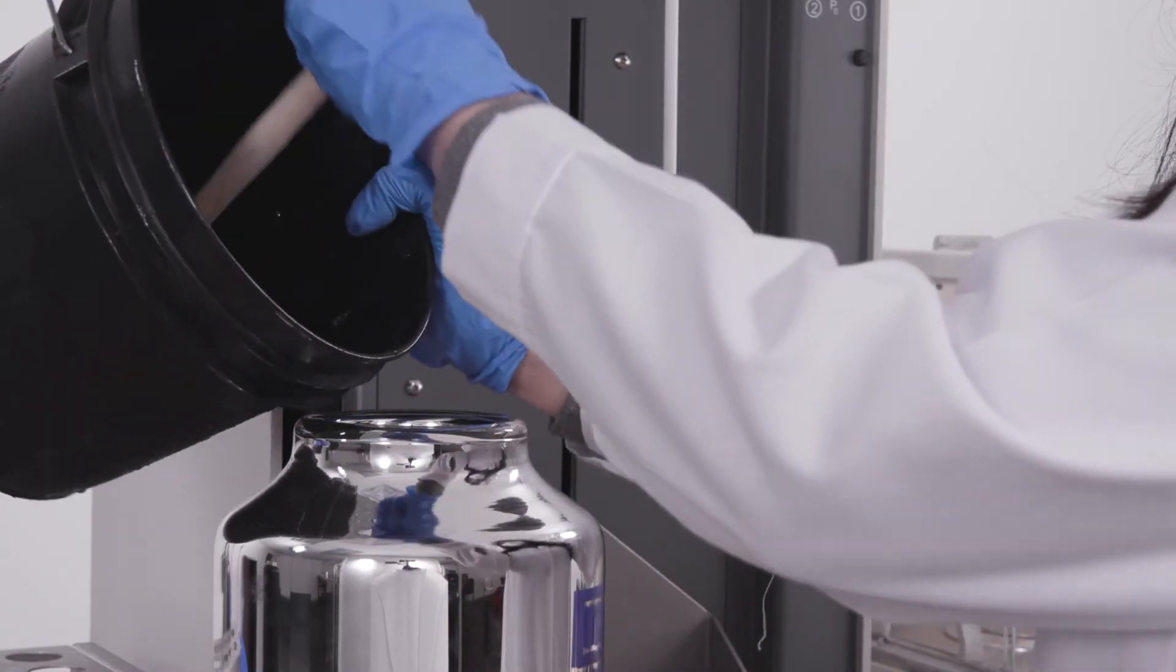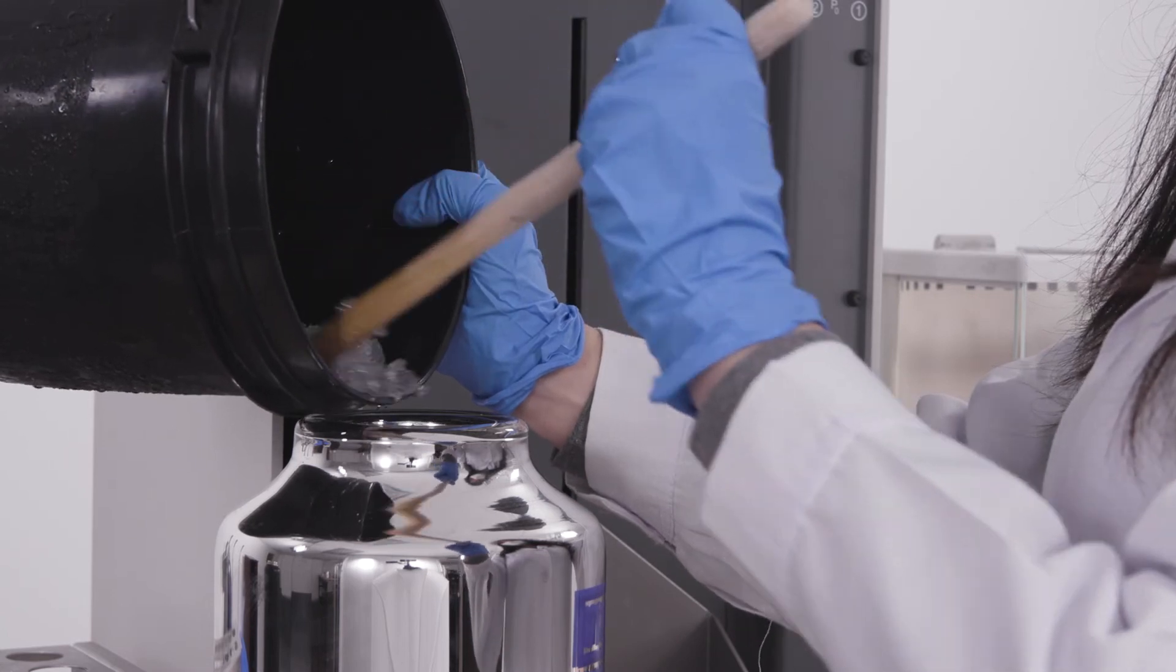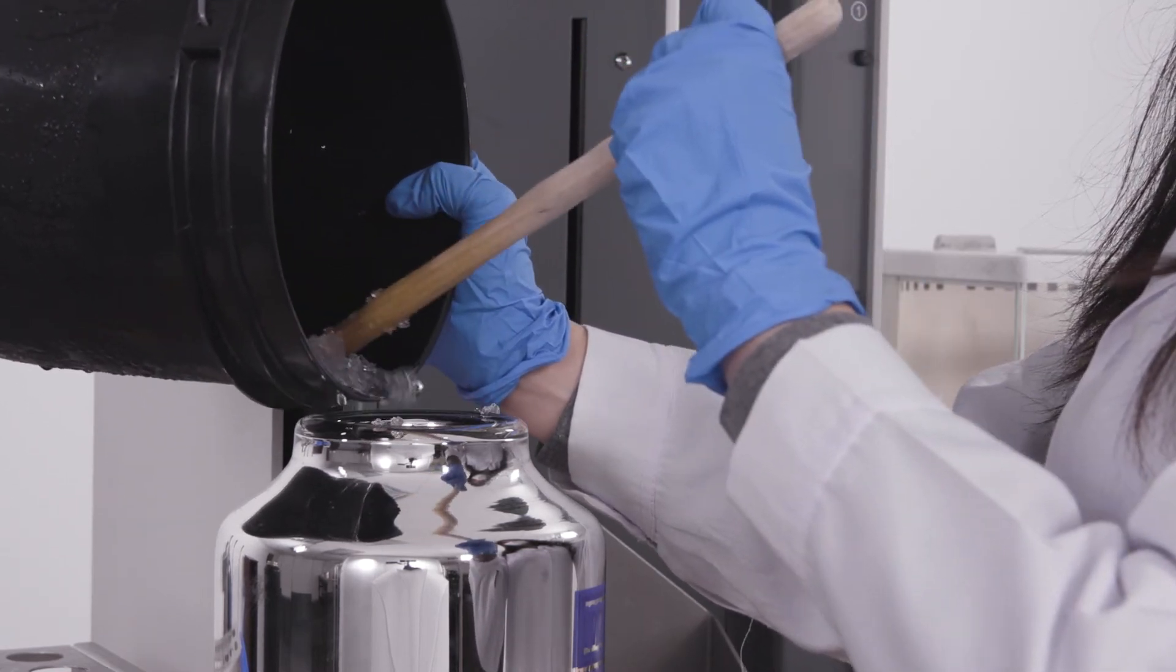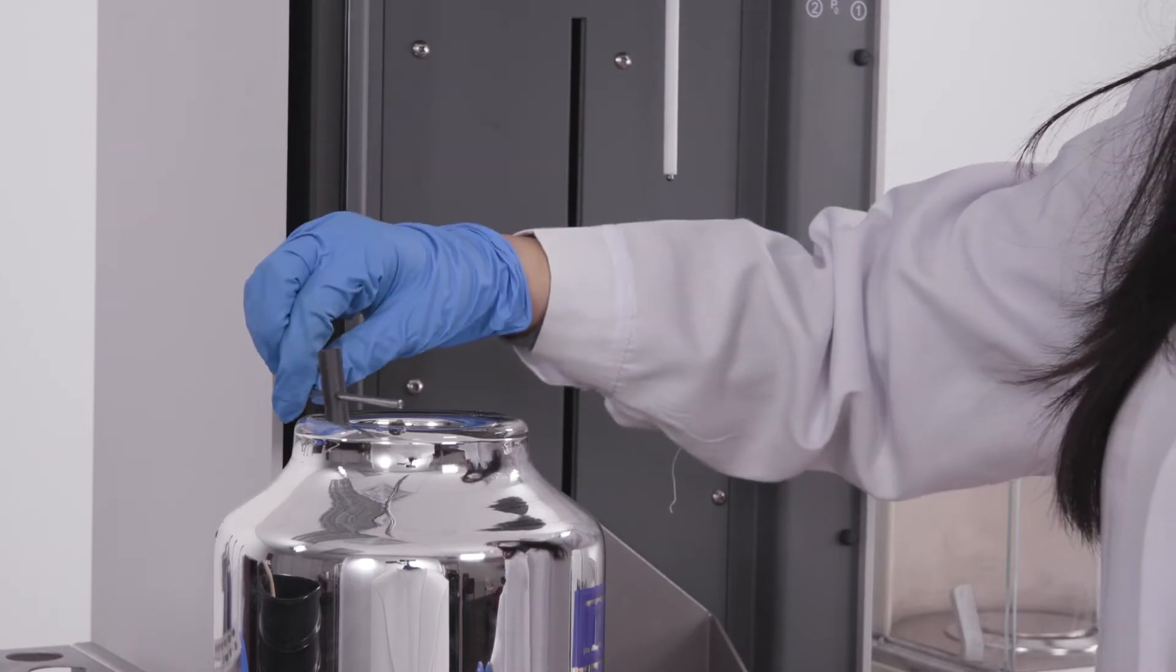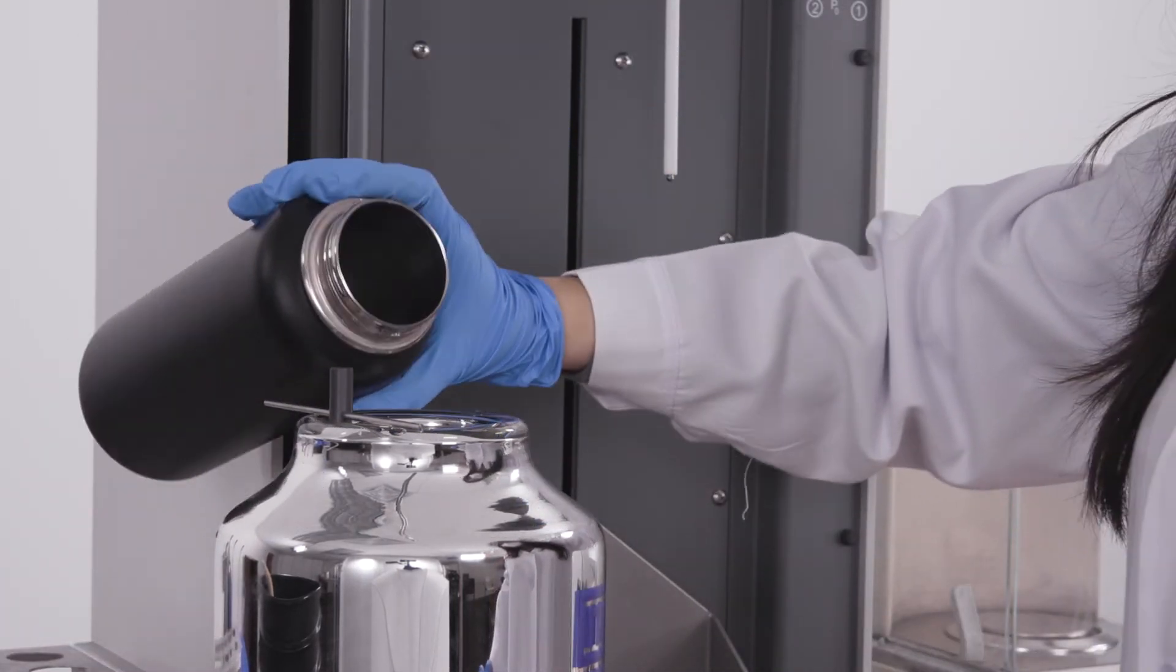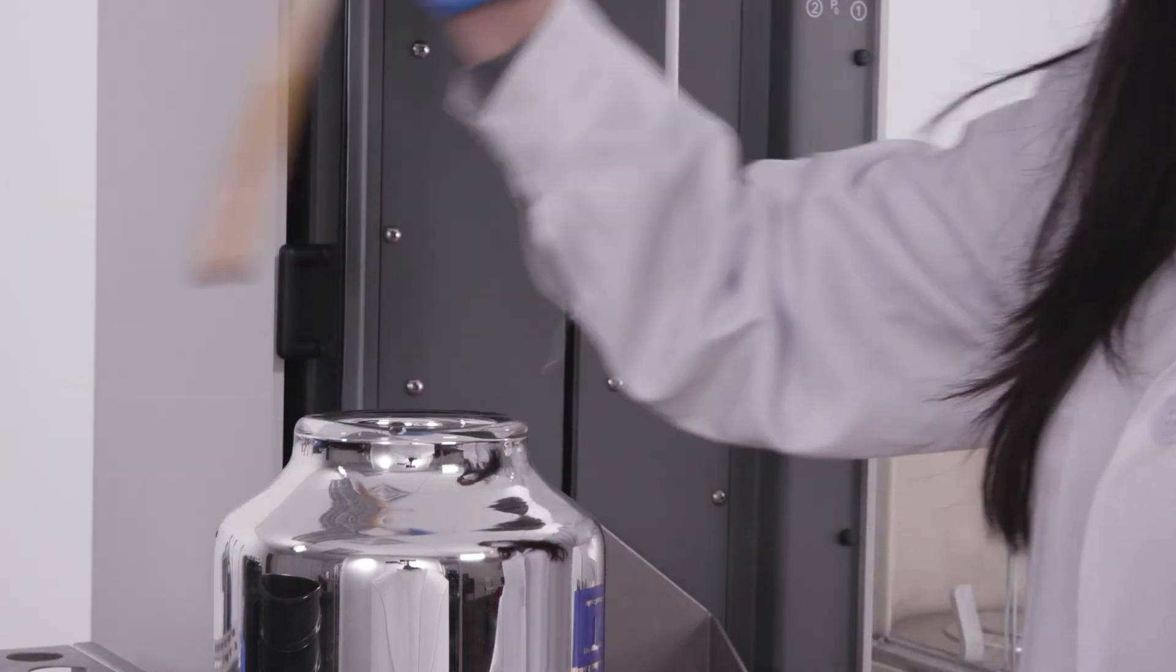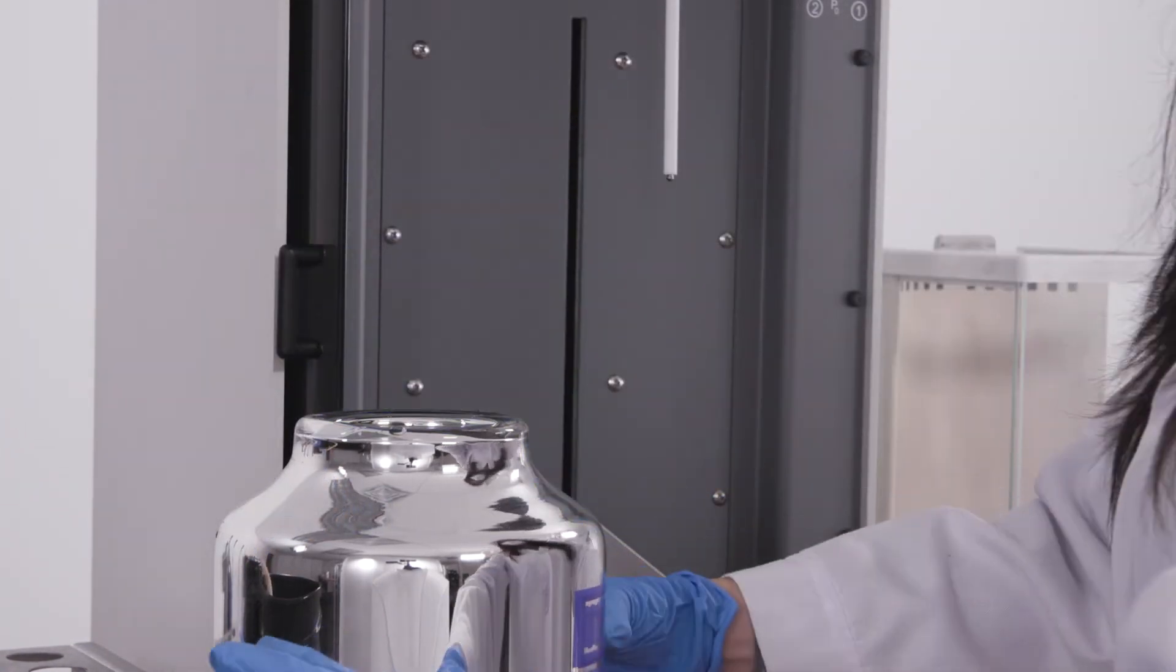Fill the dewar halfway with crushed ice. Add water until it gets to the dipstick indicator. Ice should still be present. Use a wooden stick to ensure the ice does not compact as the sample tube is submerged in the dewar during analysis.